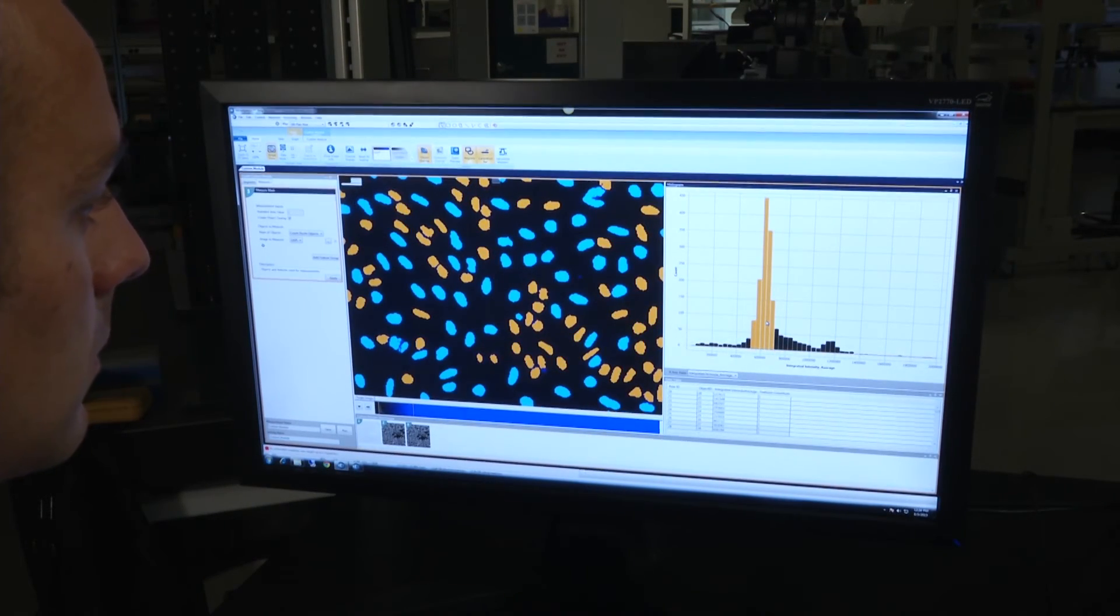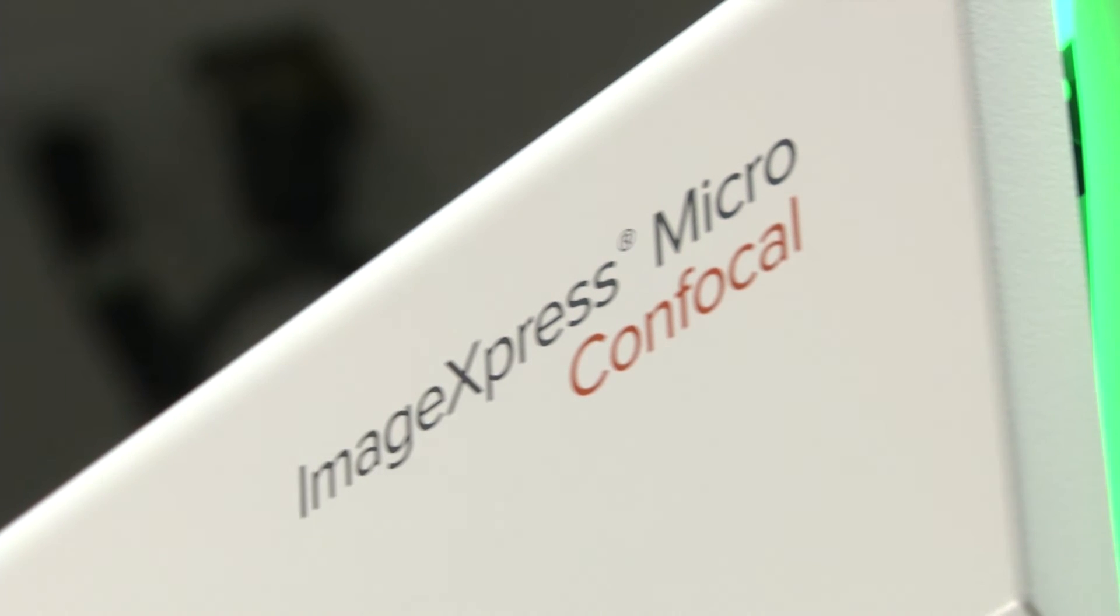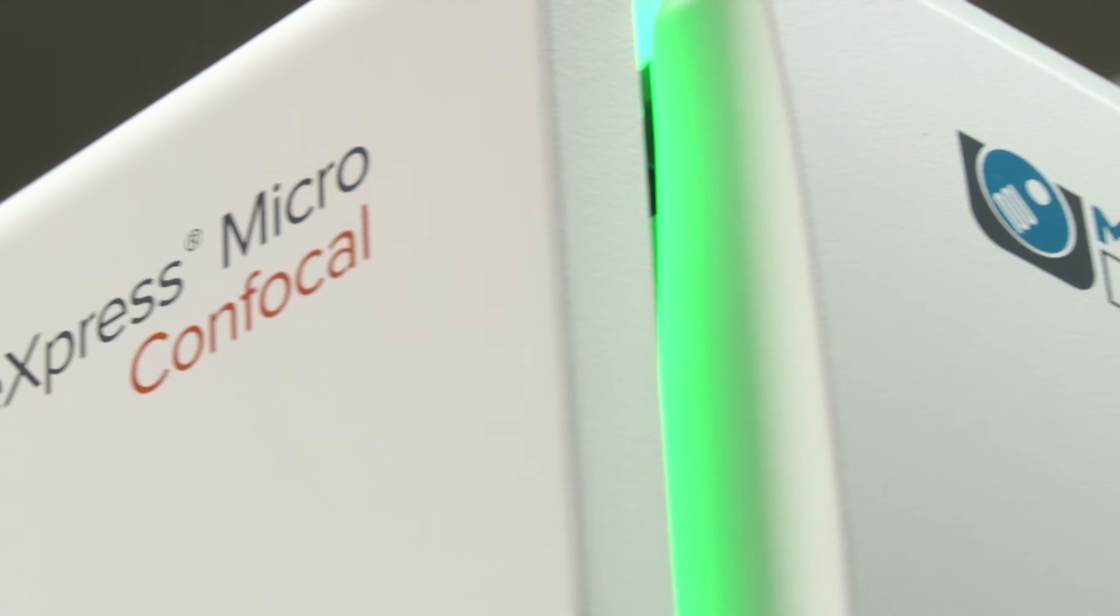Explore the new dimension with the confocal system for your complex biology. The ImageExpress Micro-Confocal High Content Imaging System from Molecular Devices.